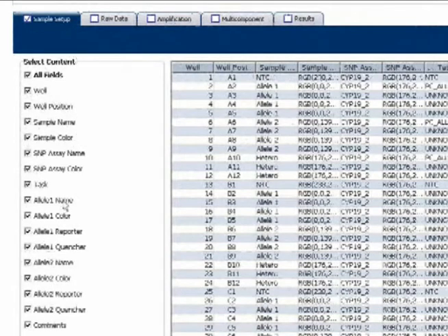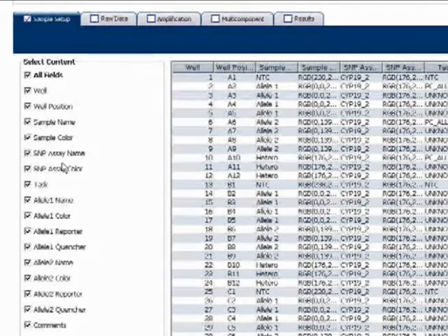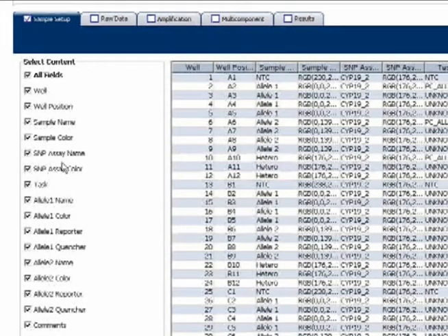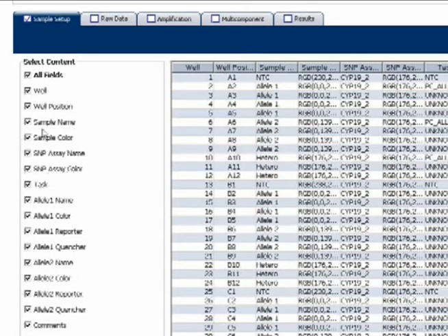Notice how many column headings there are. A lot more than we had for a gene expression experiment. When you export the setup information using a completed run file, you get to see how many columns of information can subsequently be imported using a template. And I, of course, have the option of deselecting any of these I don't want.